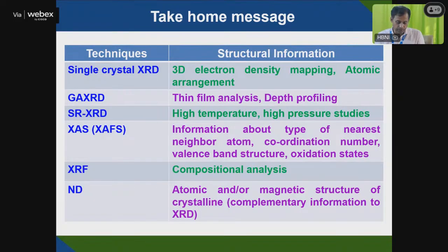With them you can measure the particle size. In the case of neutron you can vary the contrast by using a D2O and H2O mixture, and accordingly you can get the core-shell structure, micellar structure, whether it is spherical, elongated, or hexagonal, by fitting the intensity versus Q. P(Q) is the intraparticle term and S(Q) is the structure factor, the interparticle interaction.